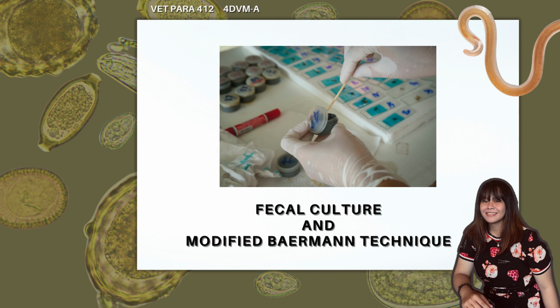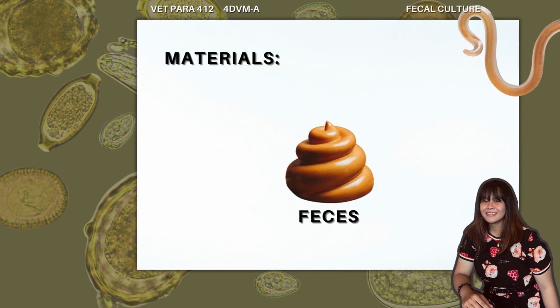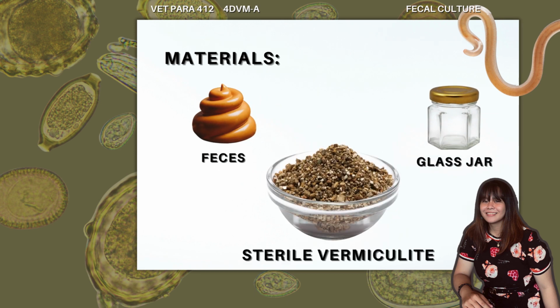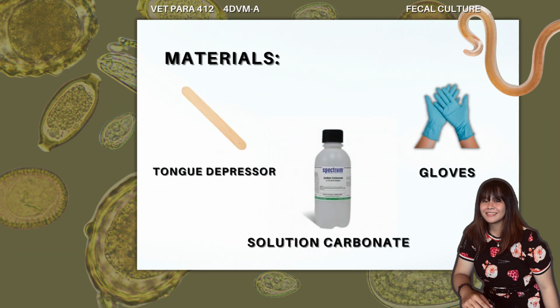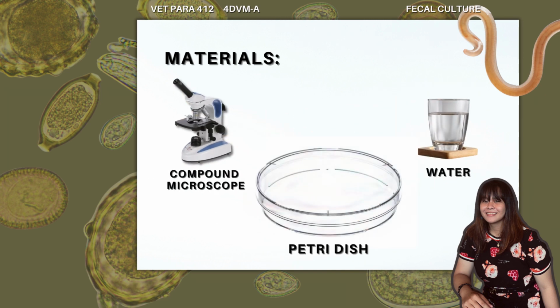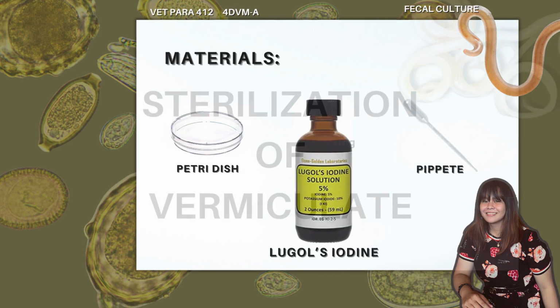So today, I will be discussing fecal culture and the modified Baermann technique. The materials used in the study are the following: grams of fresh feces from goats, glass jar, sterile vermiculite, gloves, tongue depressor, 1% solution of sodium carbonate, compound microscope, water, petri dish, pipette, and Lugol's iodine.